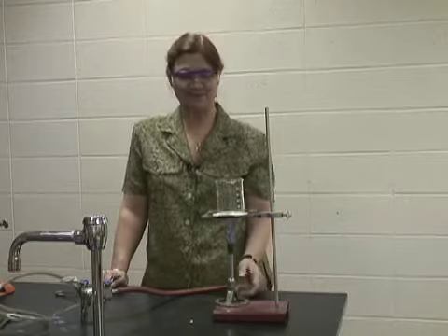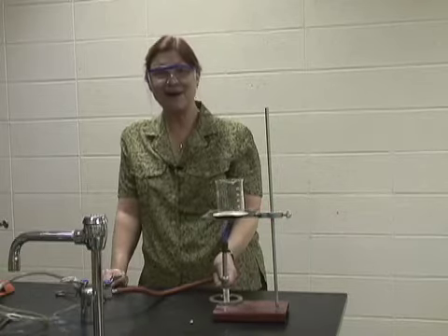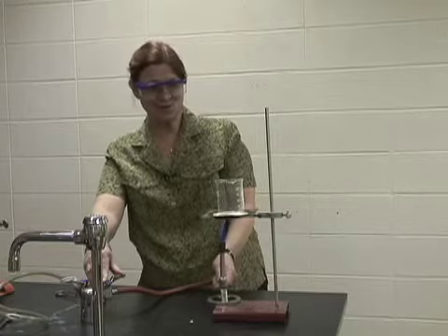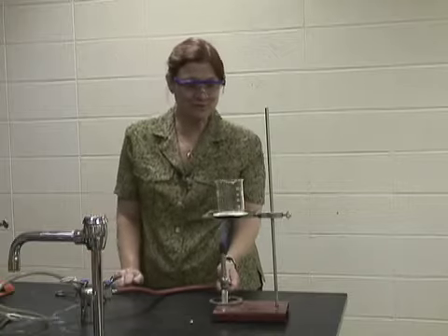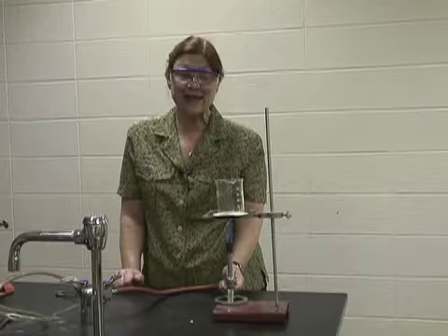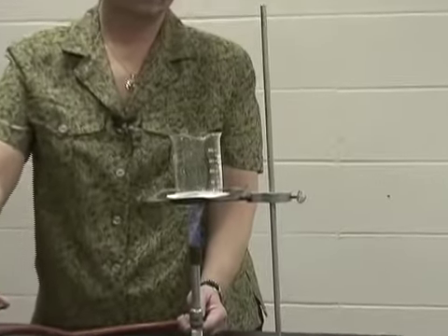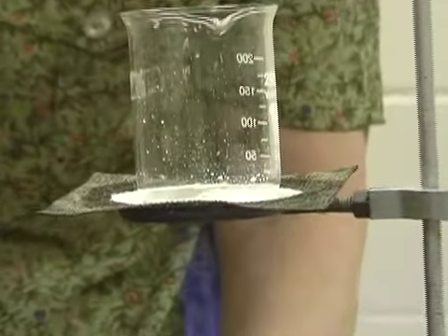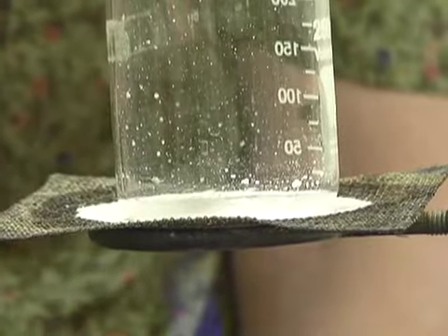I just find labs to be so much fun. Oh, that one side there, it's just bubbling. Oh, we're getting to the solid part. Oh, I see the crystal forming on the bottom. We're not that far away. I just am controlling that flame so that it's not too much.